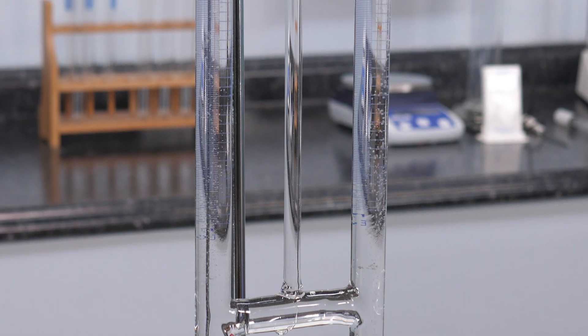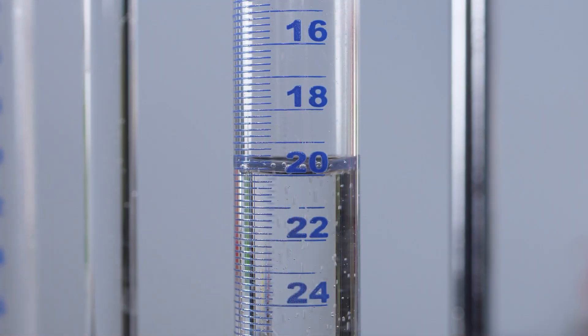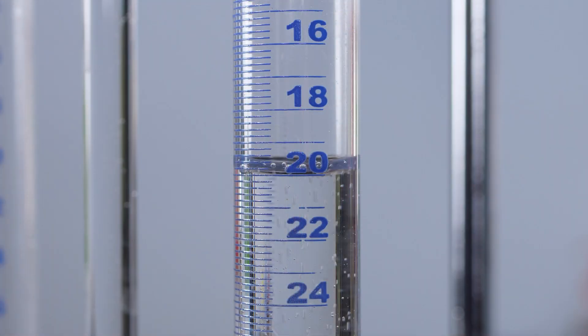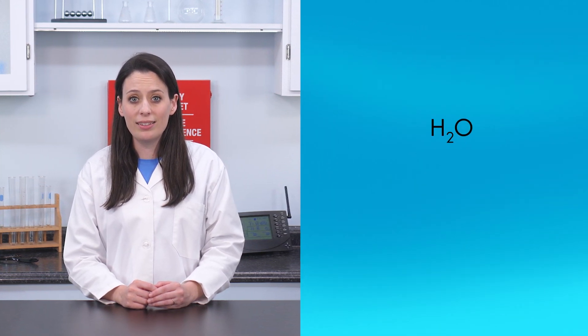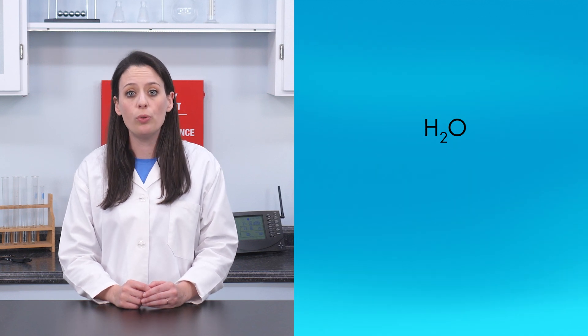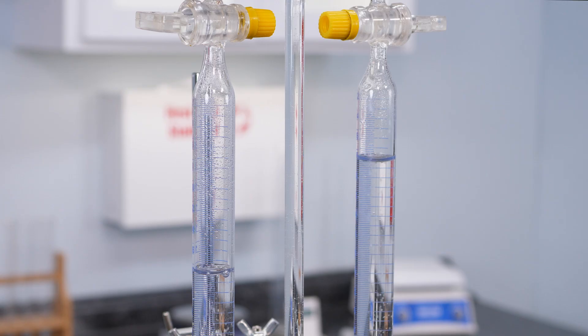We will allow the electrolysis to proceed for a few minutes and then check the results. We have collected 20 milliliters of oxygen gas in the right tube. During the same time, we collected 40 milliliters of hydrogen gas in the left tube. We have collected twice as much hydrogen gas as oxygen gas. This is because the chemical composition of water is H2O—two parts hydrogen and one part oxygen. To confirm that we have hydrogen and oxygen gas, we will perform two final tests.